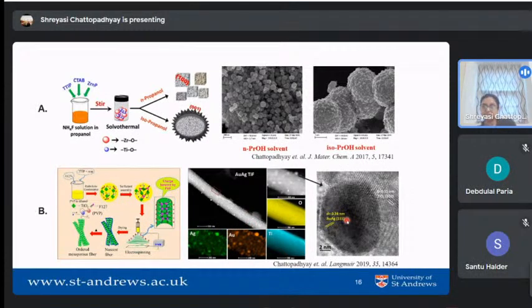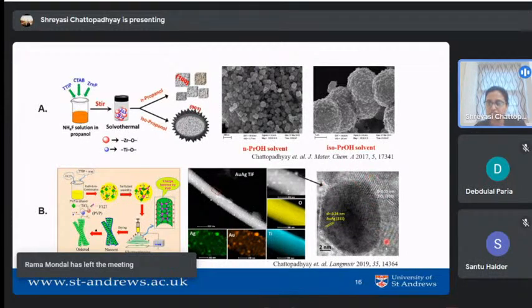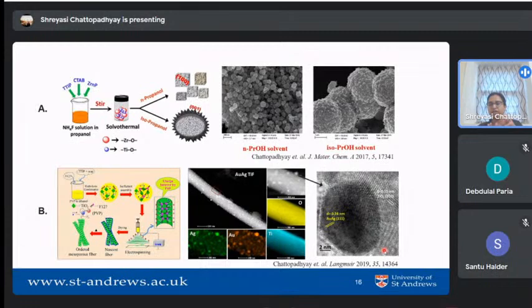And for how they are sitting on the TiO2 fiber, we did TEM, and you can see this nanoparticle is well immersed on the surface of the TiO2 fiber. So they have good attachment with each other.